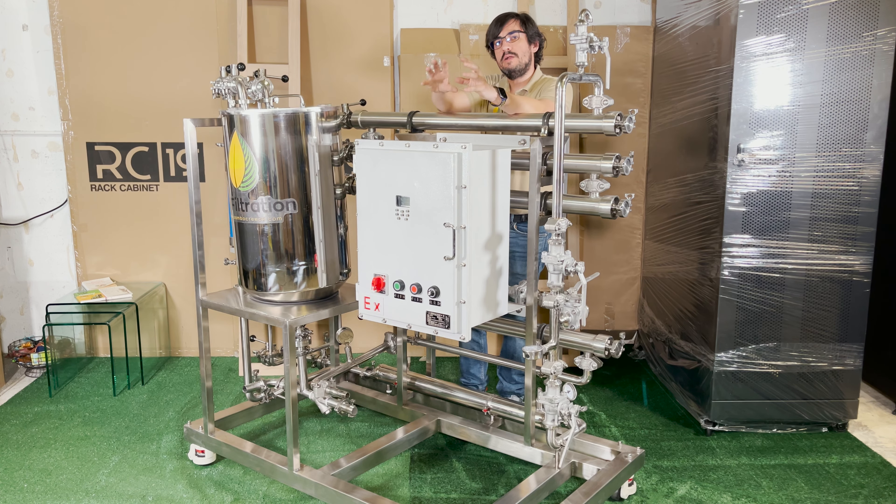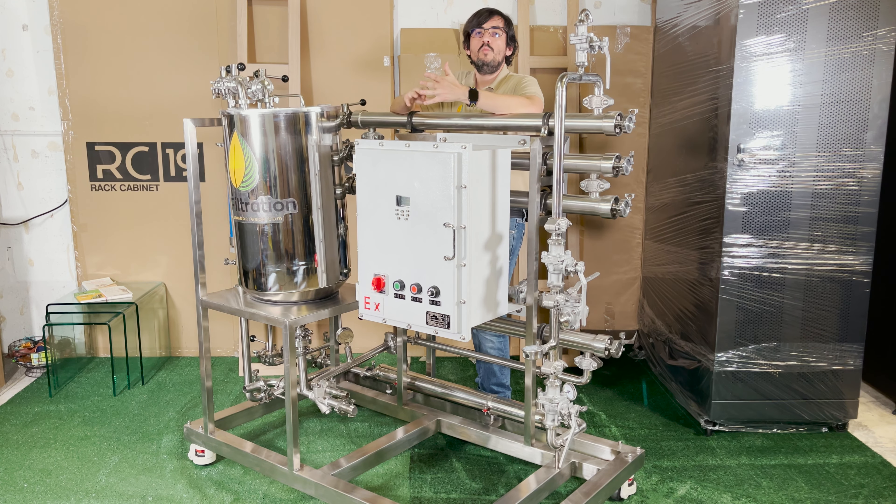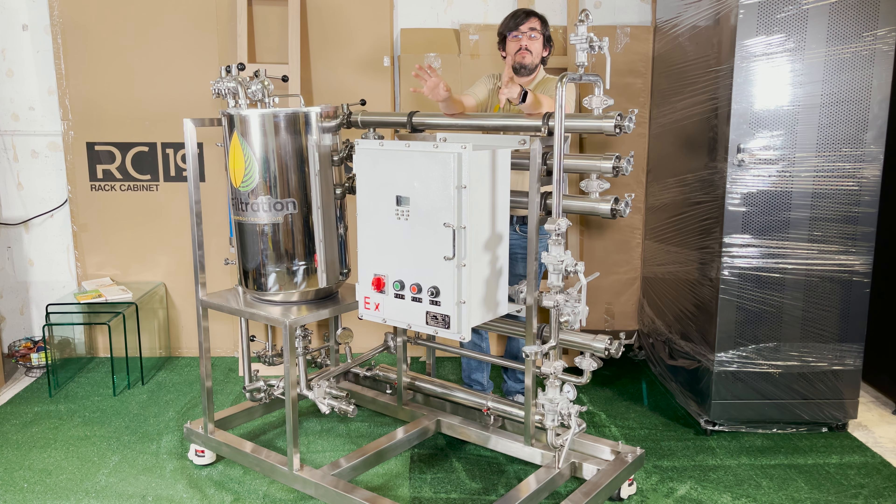We're removing particles at a molecular scale. So what does that allow us to do? Several things. Number one, we're able to remove solvent — pretty much any solvent from your feed. We're able to remove lipids, fats and waxes because the size is so different from the target. We can remove terpenes. We can also remove fats, waxes, chlorophylls, and sugars.